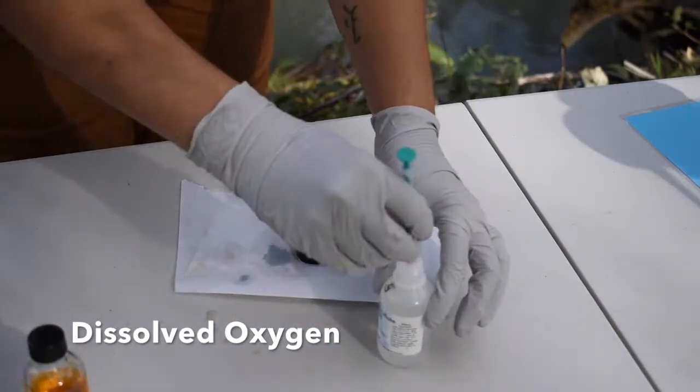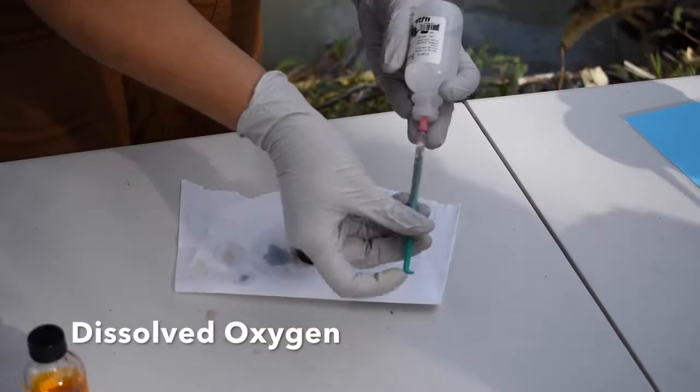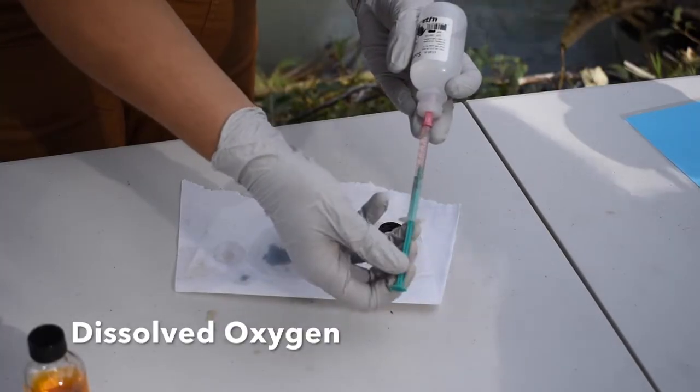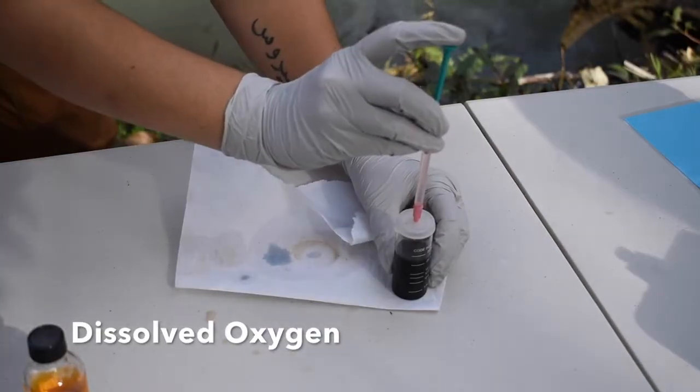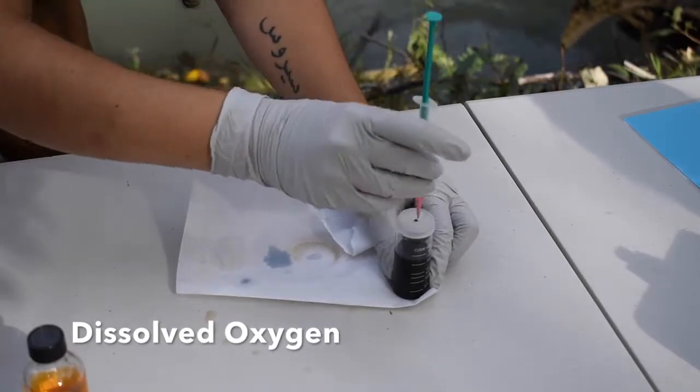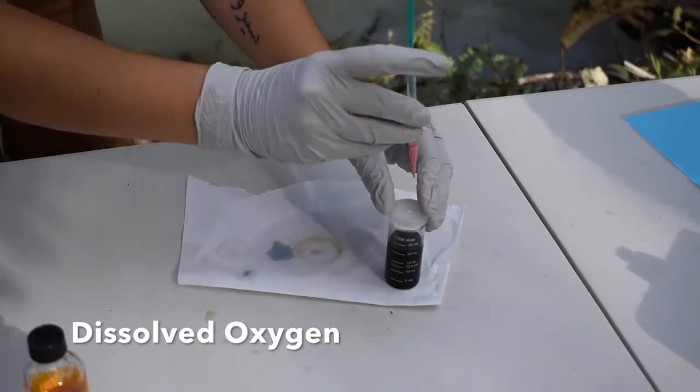Then we will fill our titrator all the way up with chemical number 5, sodium thiosulfate. Then, starting 3 drops at a time, we will add the sodium thiosulfate to our B bottle.